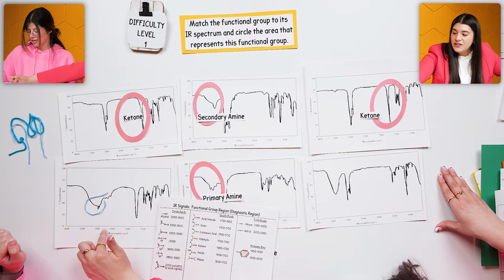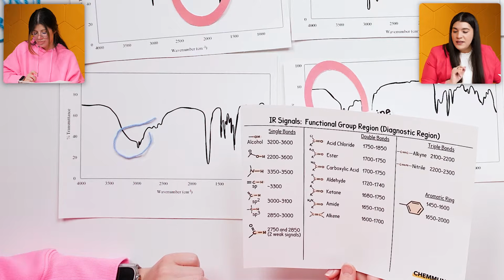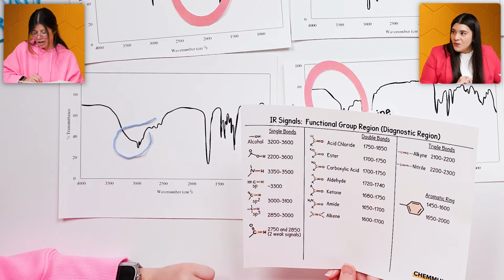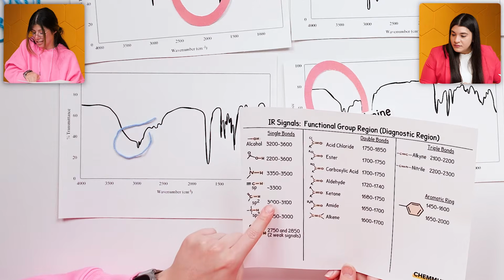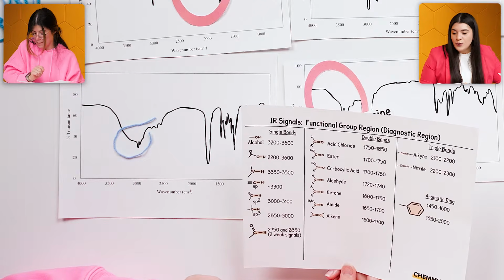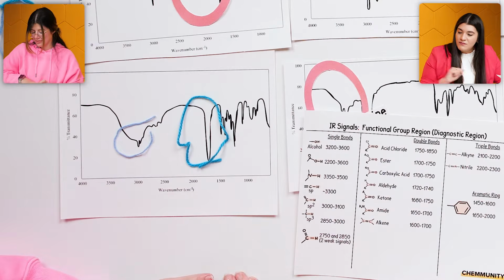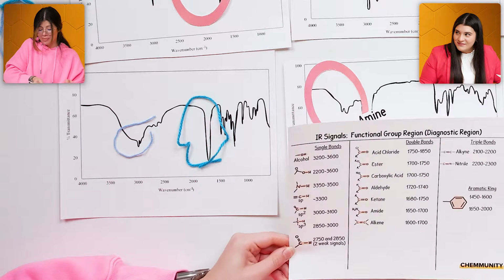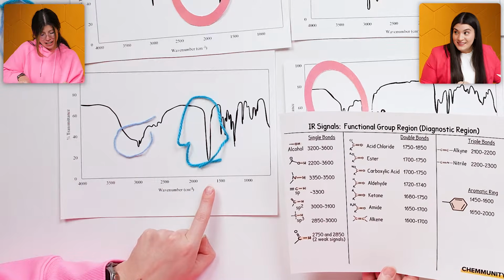What is within this region? Keep going with your thought. You thought maybe it's between a carboxylic acid or an alcohol. I was thinking around this, that would be in the range. But then... What other peak do you think would be important? This one? Good. Let's circle it. What's that probably telling us that there is? It's a single peak again. And it's around the 1,700 mark.